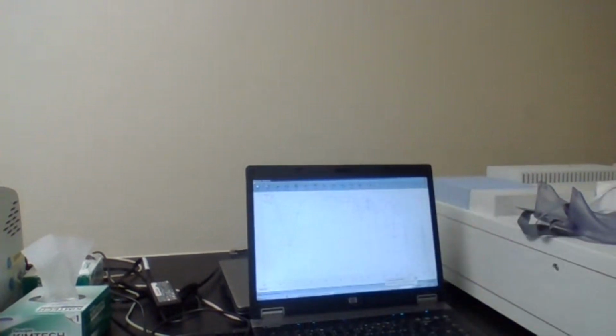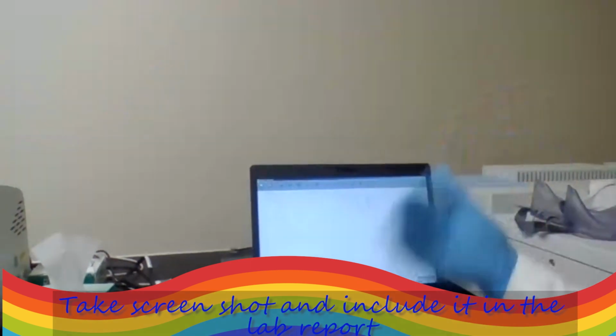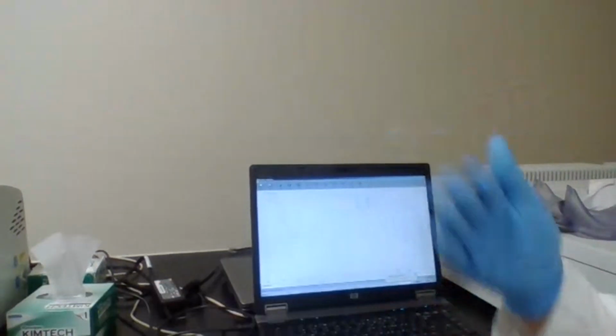I'm going to print this to make sure that I have a printout. And also, I'm going to scan this from the screen. Sometimes it gives me a better picture to email it to you.